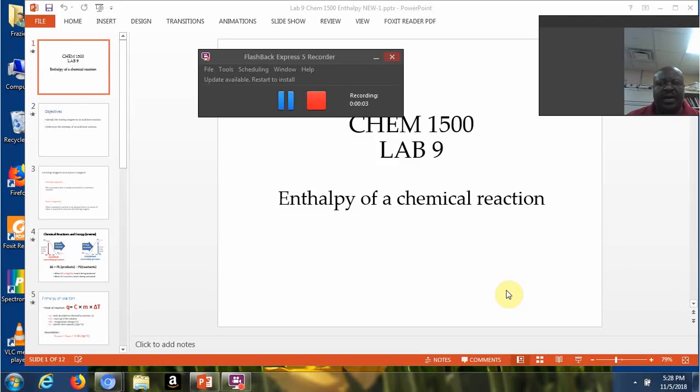Hello. Our lab in the upcoming lab session is enthalpy of a chemical reaction. What is enthalpy? We'll talk about that. It's essentially energy produced by a chemical reaction. We are familiar with reactions producing energy, the temperature going up or the temperature going down. You actually see both of them. How much energy is produced, how much energy is consumed by a chemical reaction.